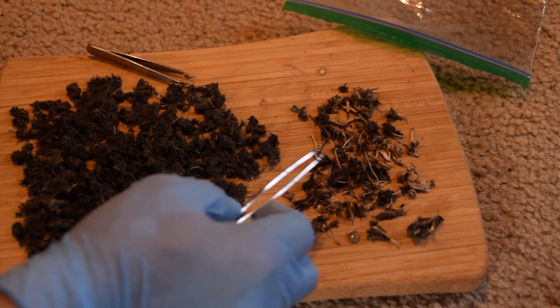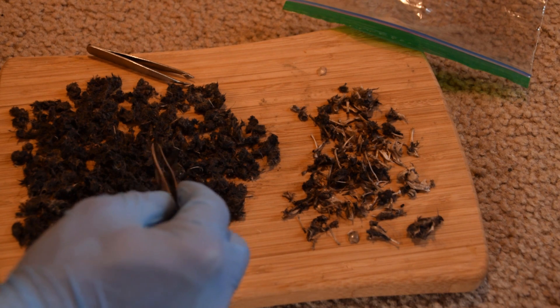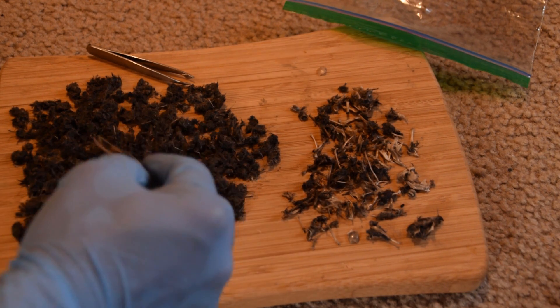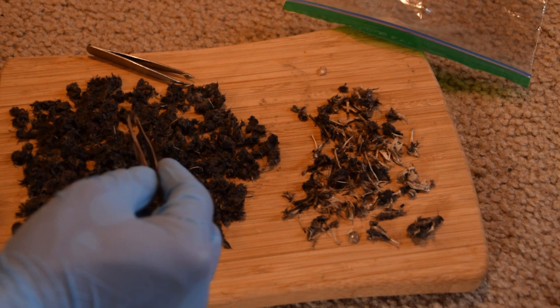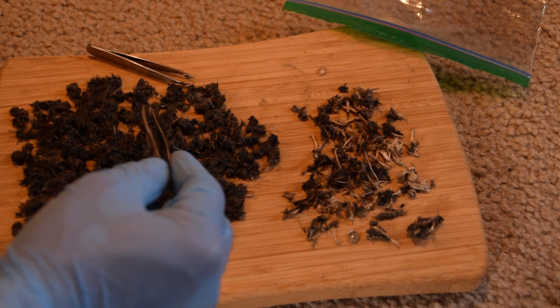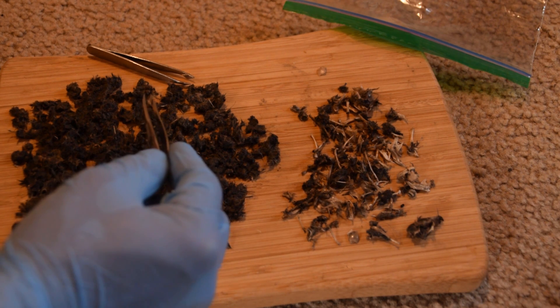Now I have this, for the most part, dissected. There are still a lot of really tiny bones — like rib bones and pieces of vertebrae — inside this pile here, but I'm not going to remove every little bone since I'm not going for accuracy. I'm not trying to be super scientific in any way; I'm just really curious to see what was inside of this.